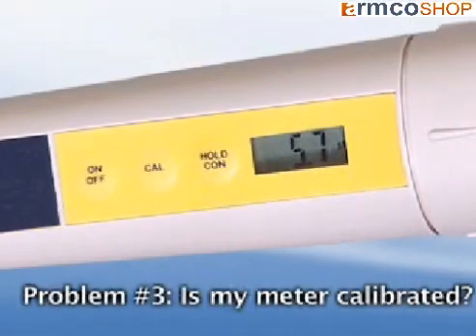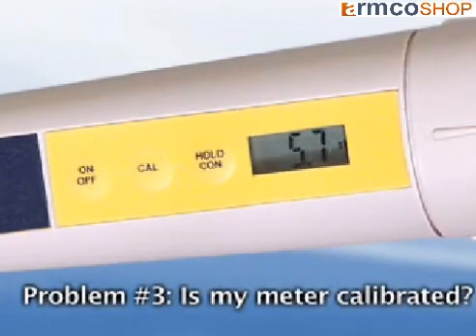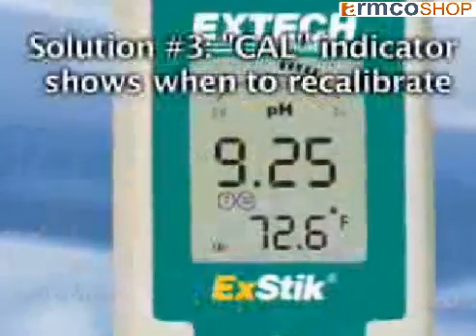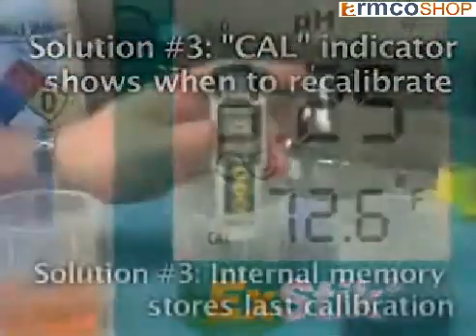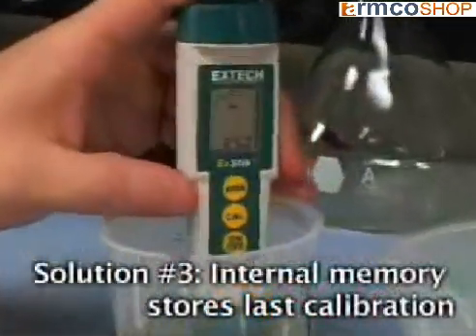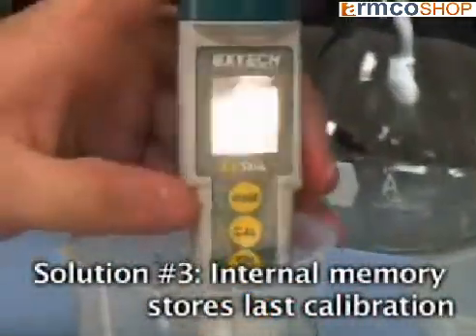Problem number three: how do I know if my meter needs to be calibrated? Solution: the X-DIC's cal indicator will appear when it is time to recalibrate the meter. The internal memory will store your last calibration and will display on screen to eliminate any guesswork.